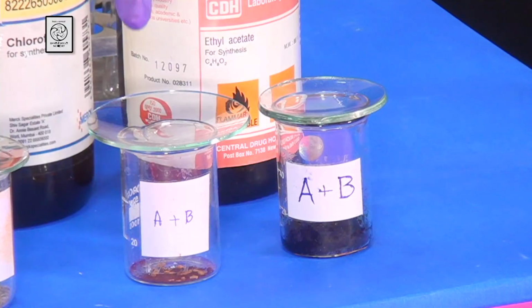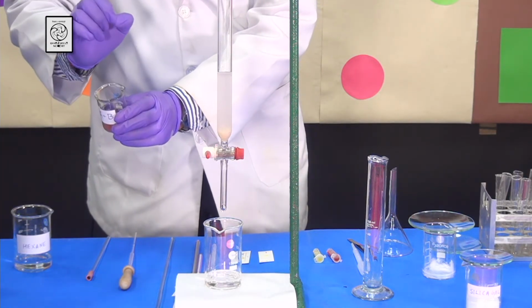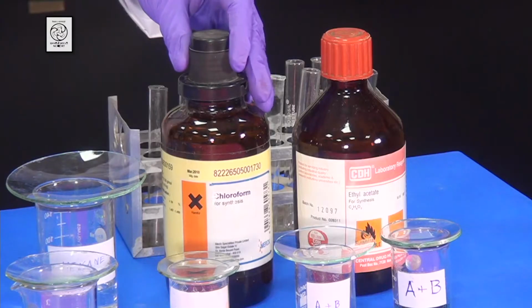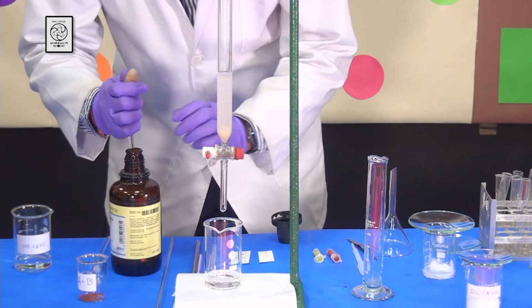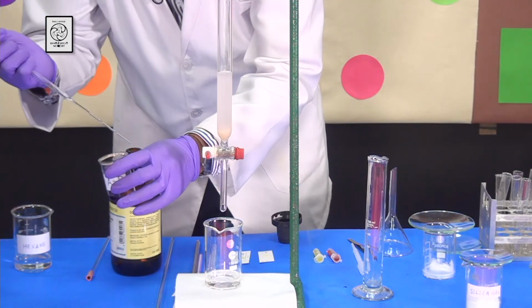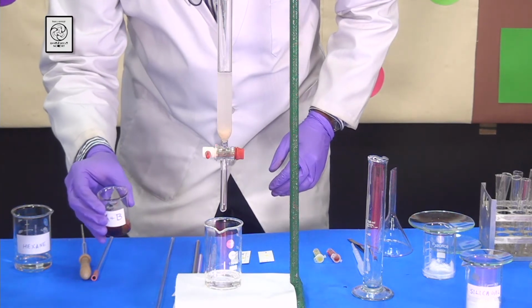So students, now I am going to take the mixture of compounds which I am going to show you here and add some chloroform to dissolve them and some silica gel to make a fine powder. First of all, I am going to take some chloroform, very little bit, and I am going to add it to them so that they are dissolved. Make sure that they are almost completely dissolved.